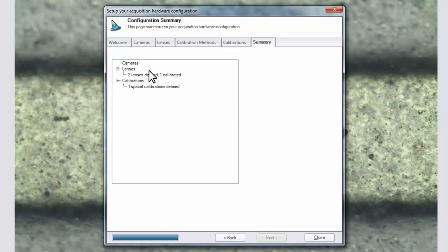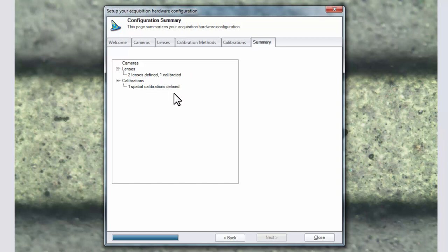Here we've defined the two lenses. The one new one that we added and the 10x objective that we chose in the lens library. Only one of which was calibrated. One spatial calibration was defined. Now we can click close.